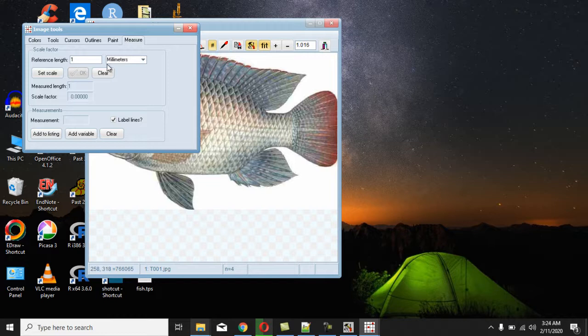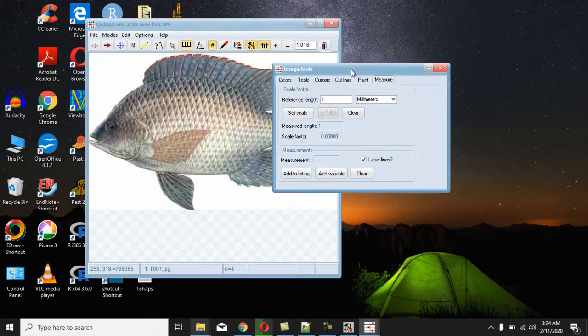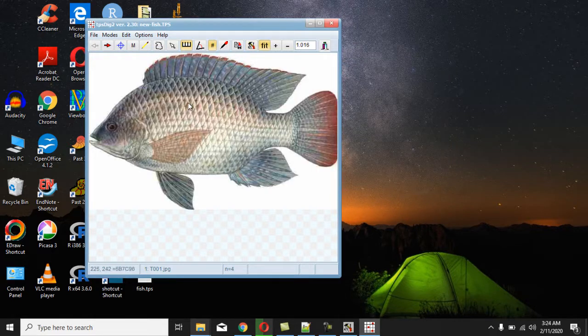All right. But if your specimen comes with a ruler, you can add the ruler to your specimen, for example here, or up. Then you can click on set scale and drag, maybe 1 centimeter. If you want to use centimeter, you just change to centimeter here. But I'm using the default length here, 1 millimeter. So if you don't want to use a ruler for now, just leave the ruler alone.